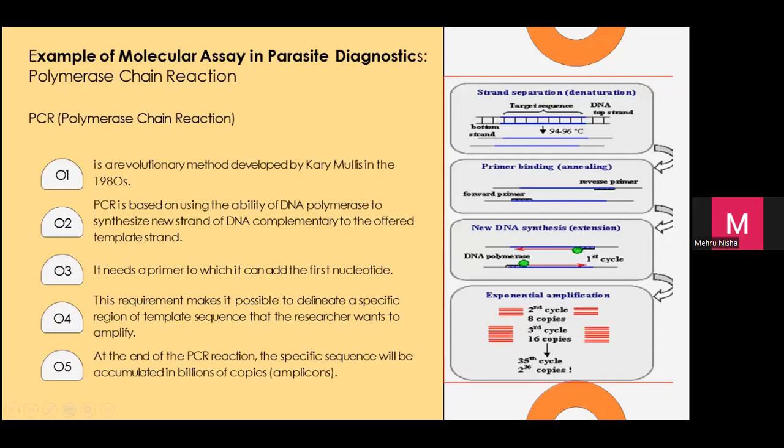This is Ascaris lah, Ascaris punya DNA. Jadi saya nak I just dapat, let's say, satu cacing saja dari sebuah kampung, tapi saya nak tambahkan cacing dia untuk simpan reference saya. So what I will do, I akan design primer untuk satu region. So first stage PCR, kita kena bagi suhu yang sangat tinggi, 94 to 96 degrees, untuk pecahkan DNA dia.